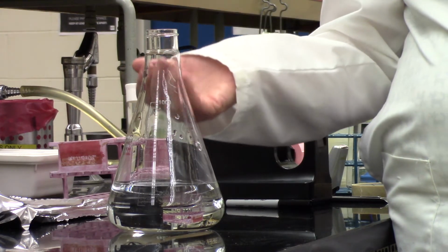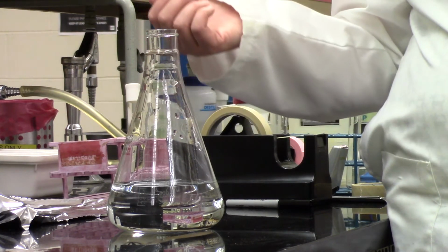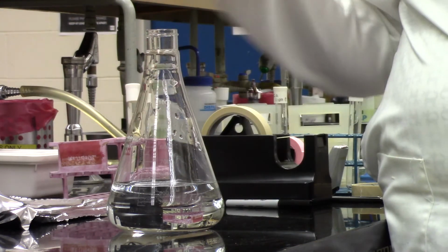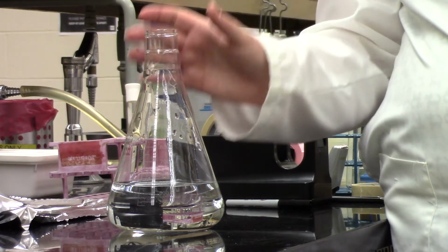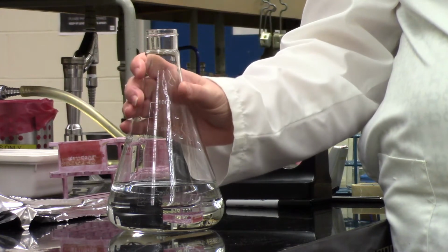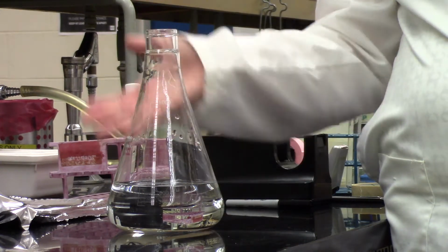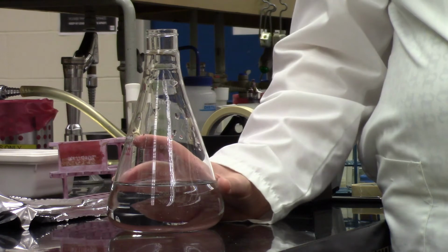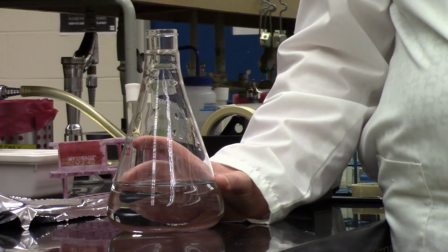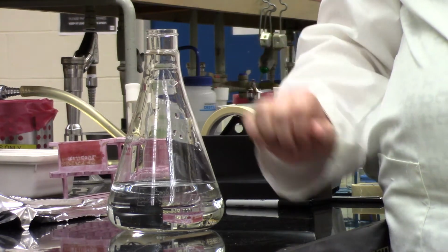So not only will the liquid eventually boil up and perhaps spill over, when the autoclave cycle ends, it actually has kind of a vacuum setting to get rid of all of that extra steam. And if your flask or tube is open, your media will get sucked up into the autoclave, which not only do you lose your media, it's also extremely bad for the autoclave and will lead to a really expensive maintenance bill. So we always need to make sure that the opening of our flask is covered.